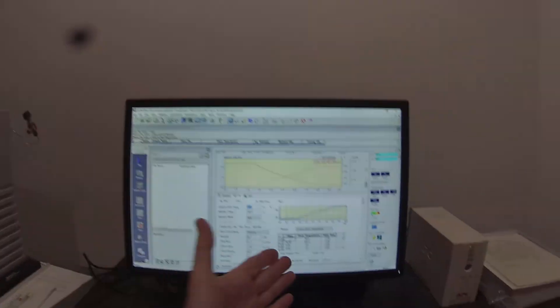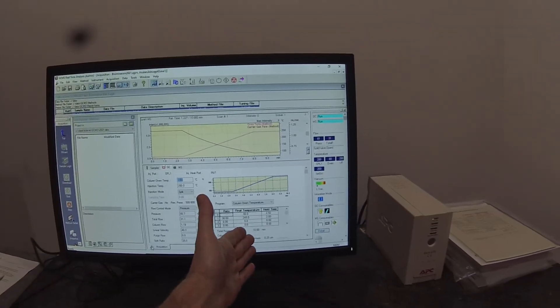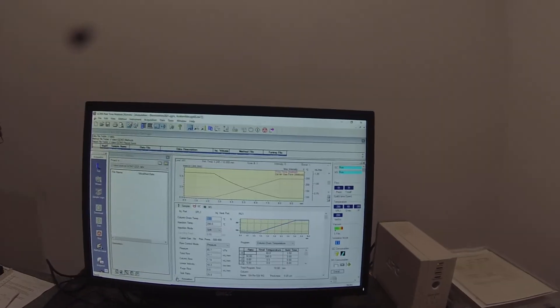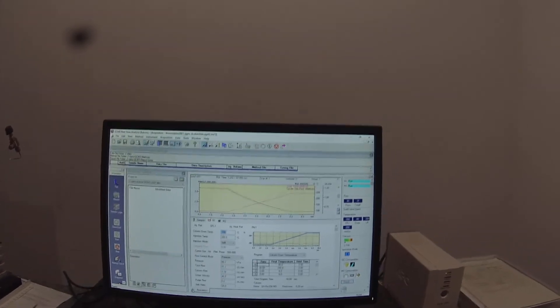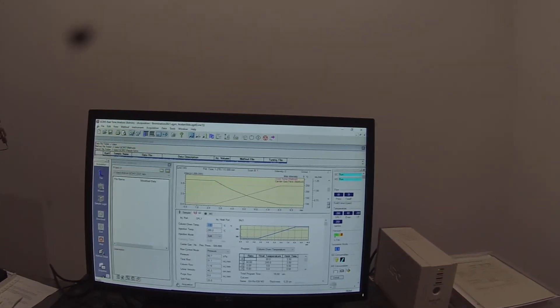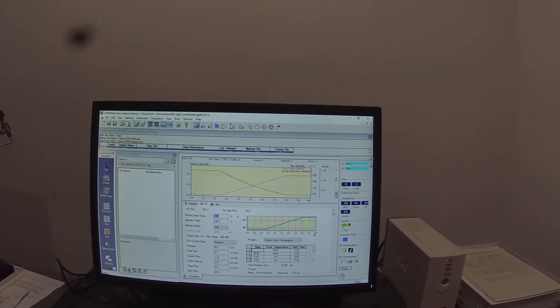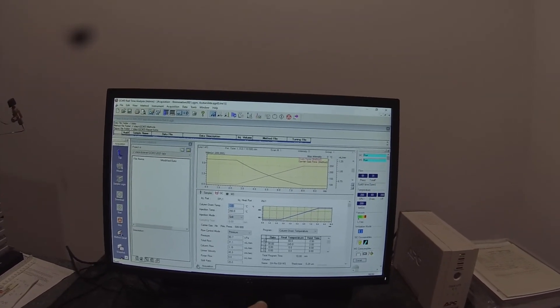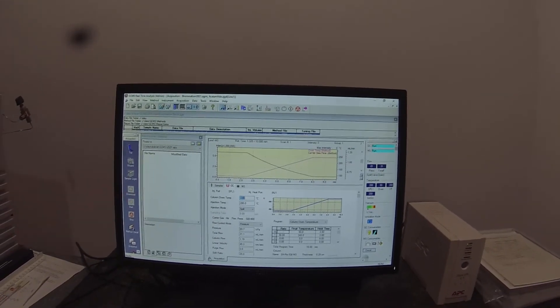So that's going to run and we're just going to let that go and go do something else while that batch is running. It's going to take 40 minutes plus the reset time when it cools back down from the 245 degrees to 80. So we got probably a little less than an hour to wait before this data comes up.